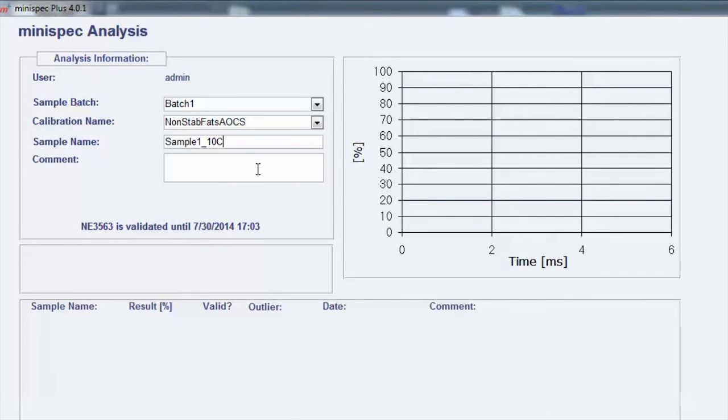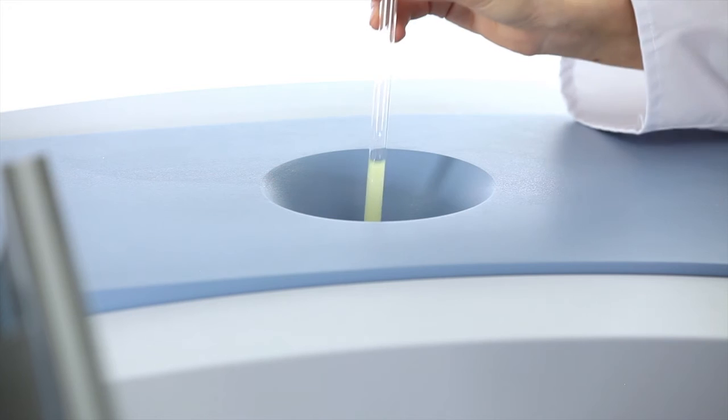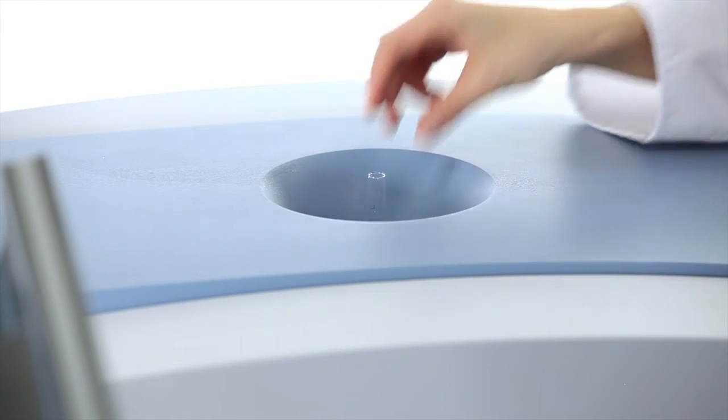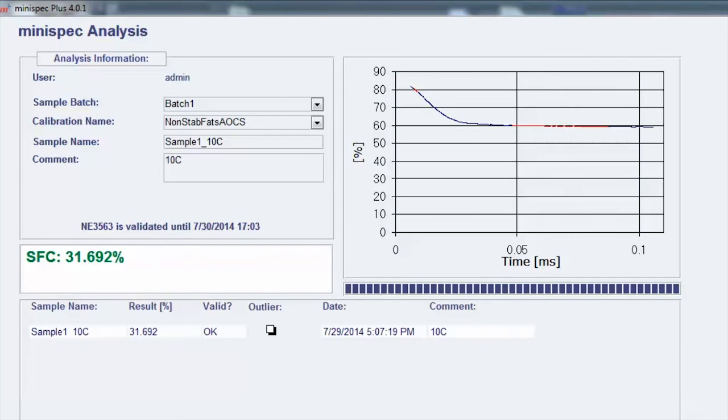The measurement itself is very fast. Insert the sample tube into the minispec. The measurement starts automatically by sample detection, and the results are shown within six seconds.